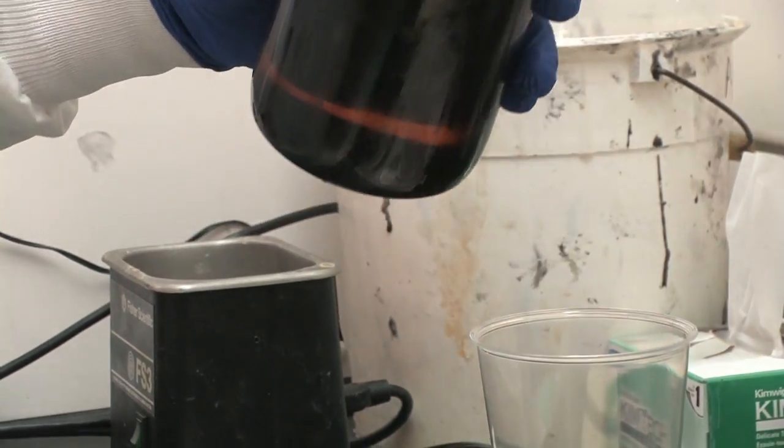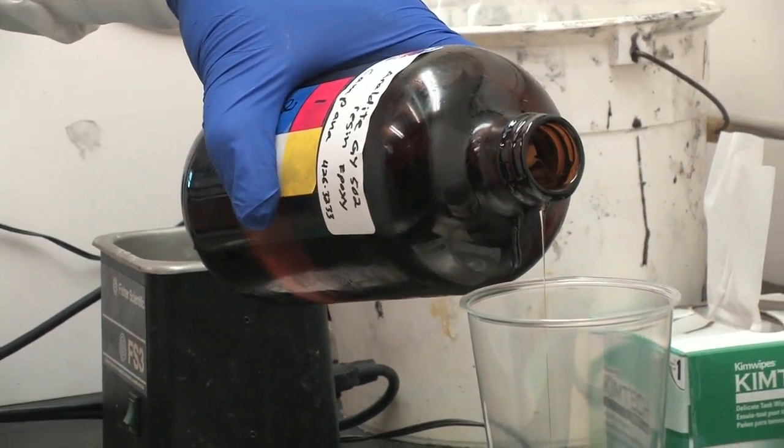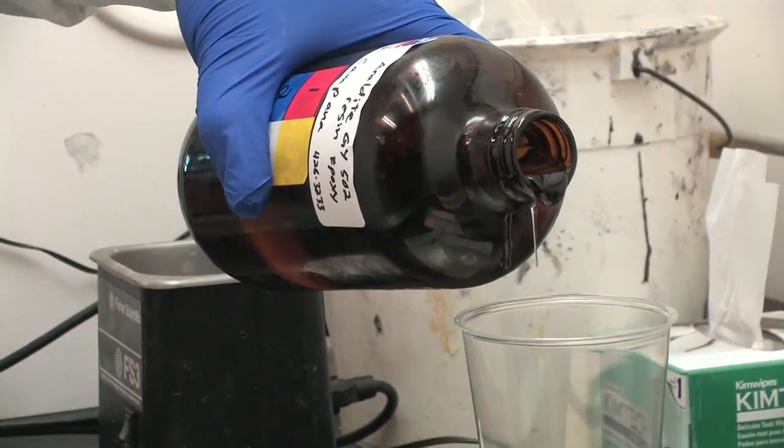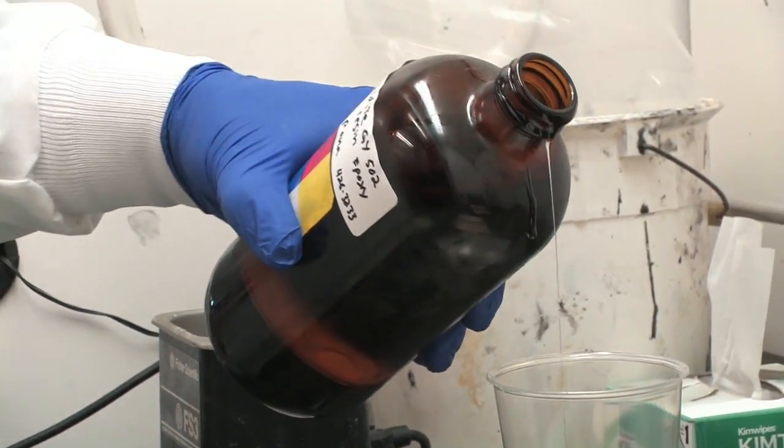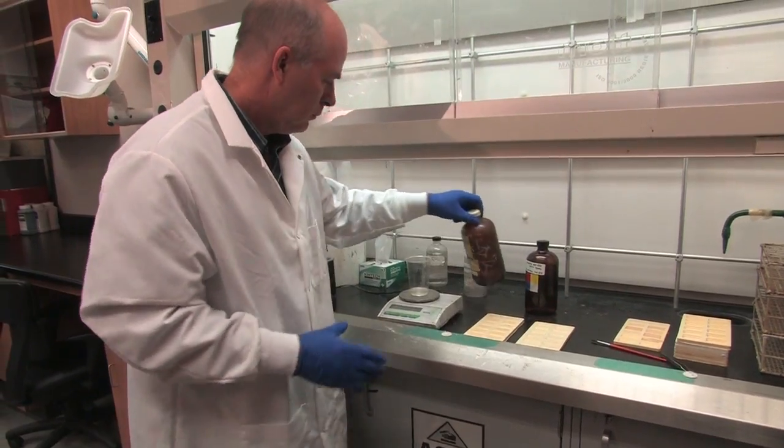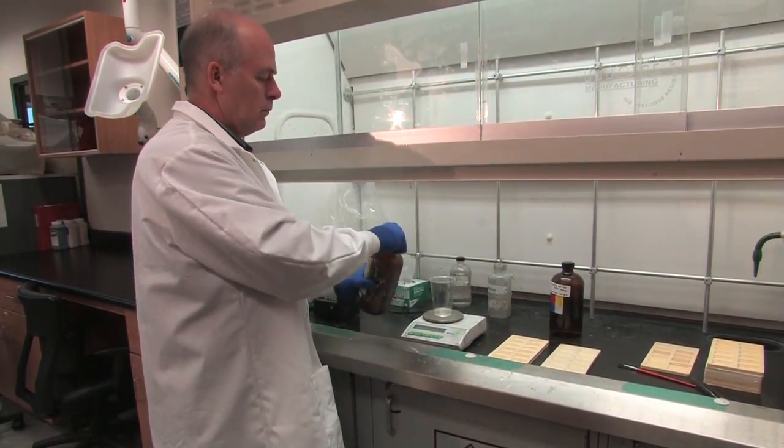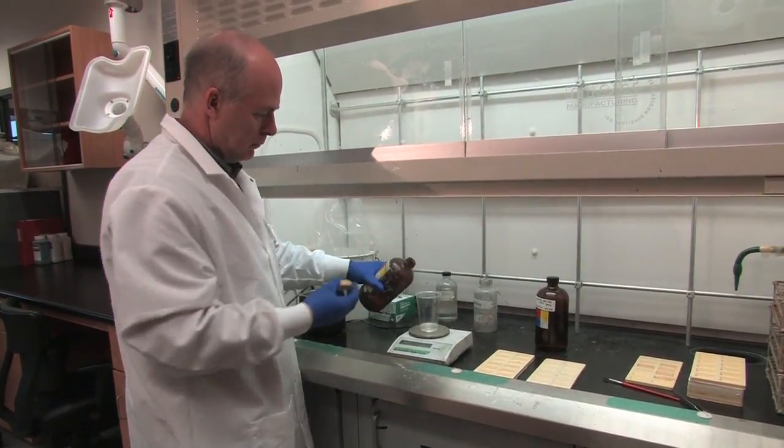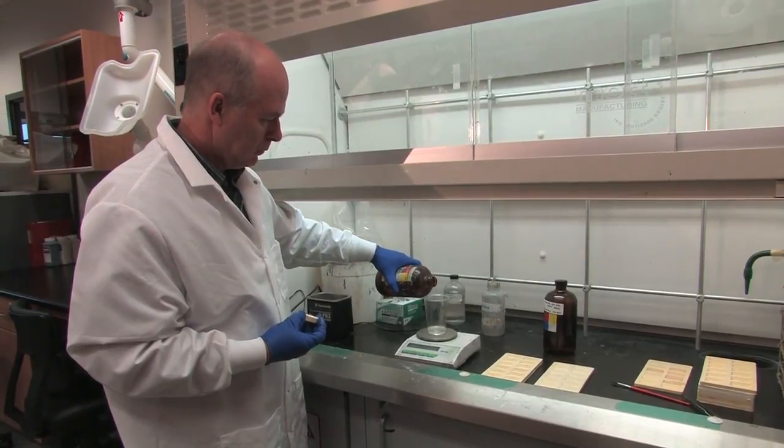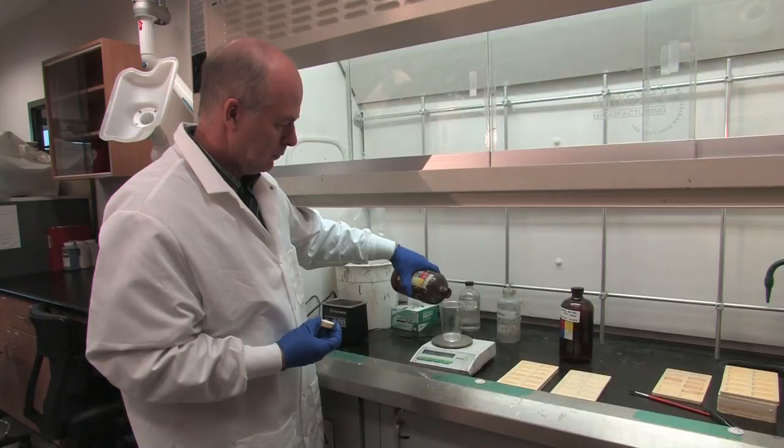Add the epoxy first, taking care when pouring it into the cup. If you happen to spill any epoxy or hardener, it can be cleaned up with the acetone located in the fume hood. Next, we add the hardener, so we tare the scale again and add the hardener carefully. Try to be as exact as you can with the measurements.